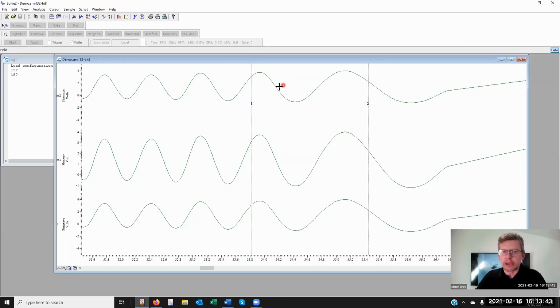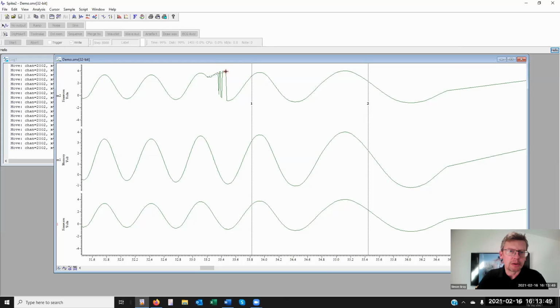So another copy here. If I now hold down Shift and draw, you can see I can draw my waveform here. Now that would be virtually impossible speed-wise if we had to rewrite these blocks of data very, very often to a disk-based channel. So these volatile memory-based channels must be written to disk at the end of the session if you wish to keep them.